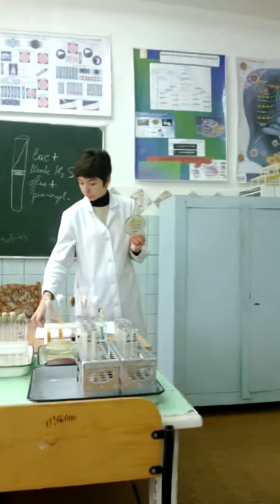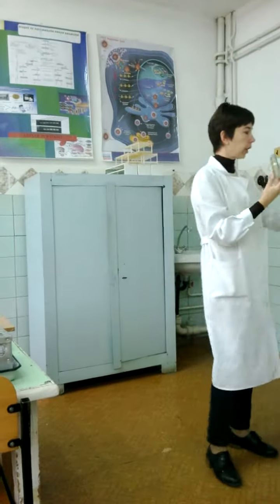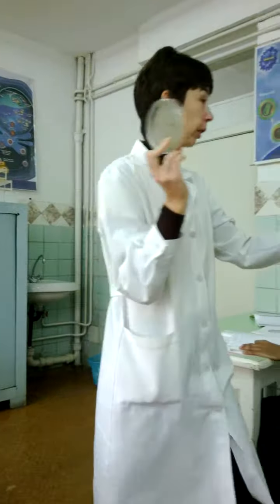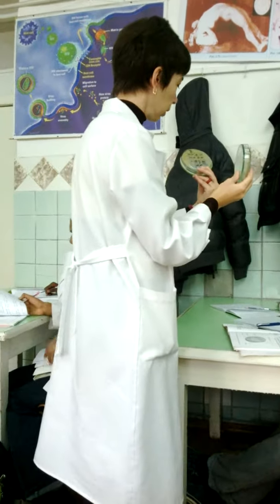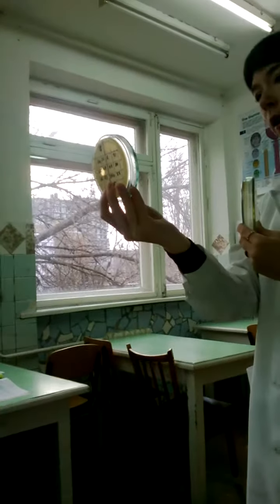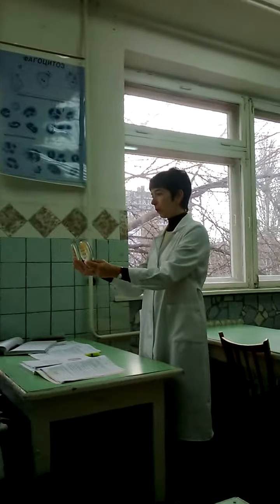This one is lysed by 6, 77 and 53, and this only by 55. Different phagotypes? Yes, different. This one is 6, 77 and 55. Is it clear? Then they're different phagotypes.